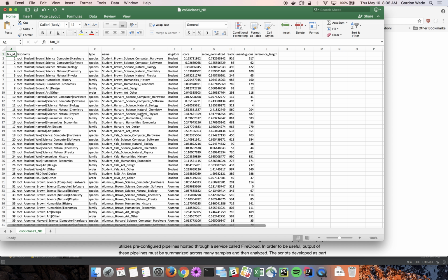analysis. So we start with some inputs like this, where we have a sample up here that's been run through the pipeline to find out what type of microbes are present in it, which would be listed here. And then there's some associated metrics listed over here. This is test data that I just made for testing and sharing with the submission.